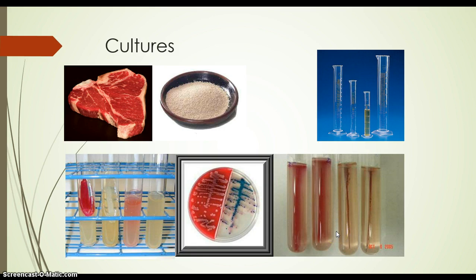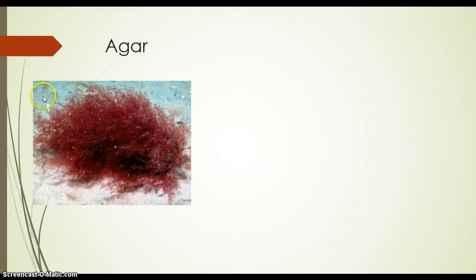We'll be getting to that next. So the agar is made from red algae. The phylum is Rhodophyta, which you will need to know. And read your lab manual to see why it is solidifying. It's because of the temperatures and the usefulness there.